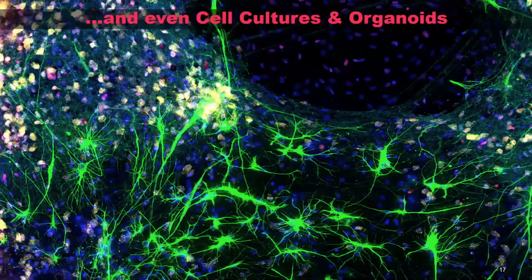Lastly, you can even image cell cultures and organoids. What you see here is a neuronal cell culture. These cells were grown directly on the cover slip. They were fixed, and then they were labeled with antibodies and processed for our imaging experiment.